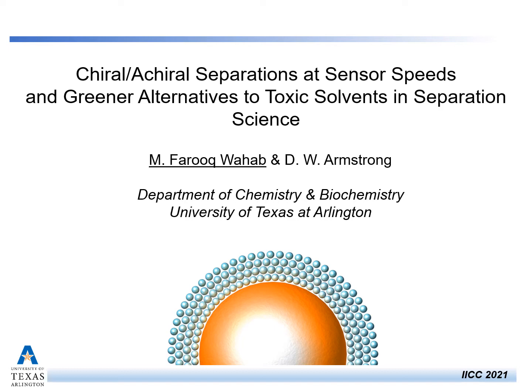Today I'll share some of our success stories in reducing the analysis time from hours to a few seconds. And secondly, we will also briefly touch upon the use of supercritical carbon dioxide as an alternative to toxic solvents.